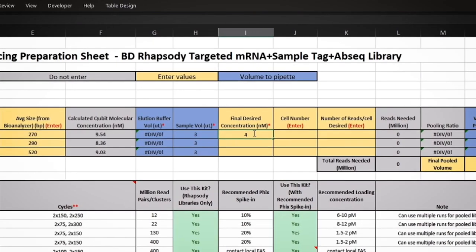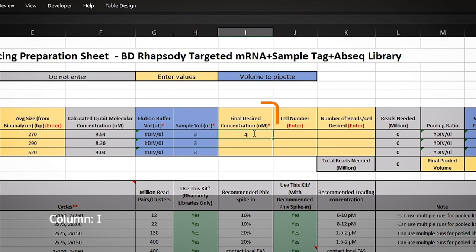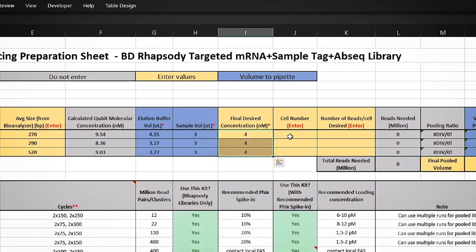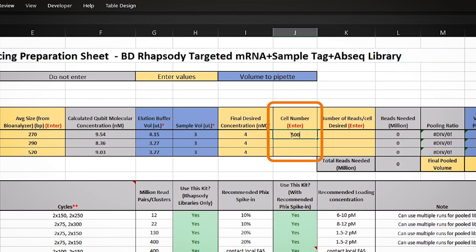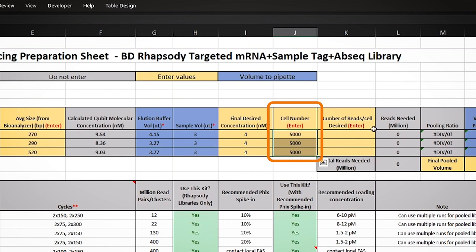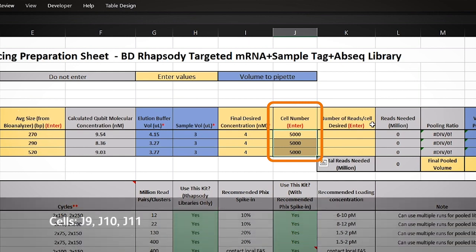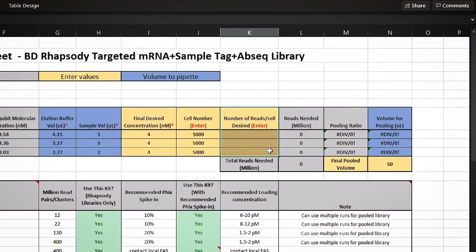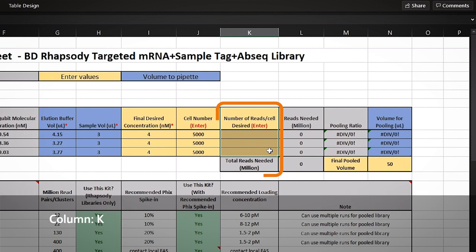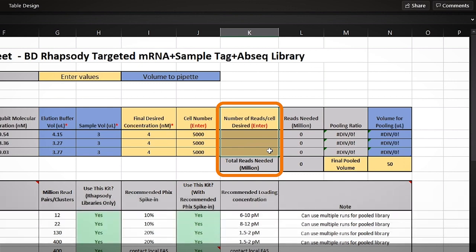In column I, the desired molarity concentration can be added. In this example, we captured 5,000 cells, so we will add that information into cells J9, 10, and 11. Column K is where the number of reads per cell is added to calculate total amount of data required and also the pooling ratios for each library.